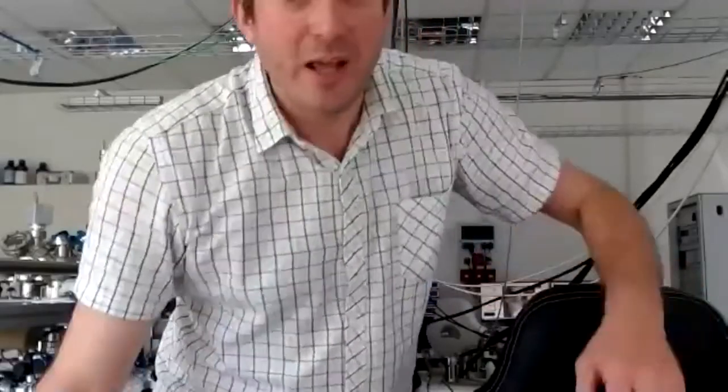So as we mentioned, you probably got a mail, sorry, probably for the late call, this morning or around lunchtime, about the experiment we are going to conduct. But even if you didn't read it or receive it, it's very simple. We will show you how to deal with the sample, put it in the chamber, fill it with gas, and do some adsorption experiment with carbon monoxide, because palladium with orientation 110 is known for CO adsorption.